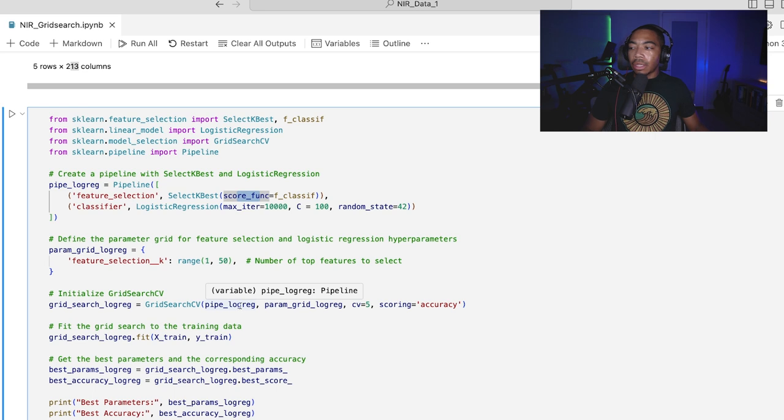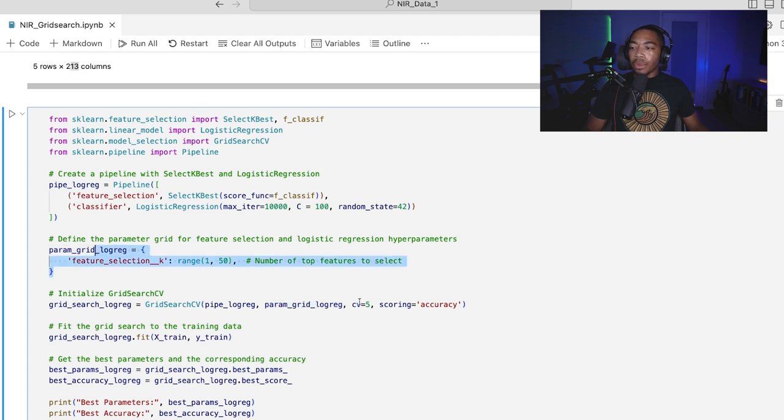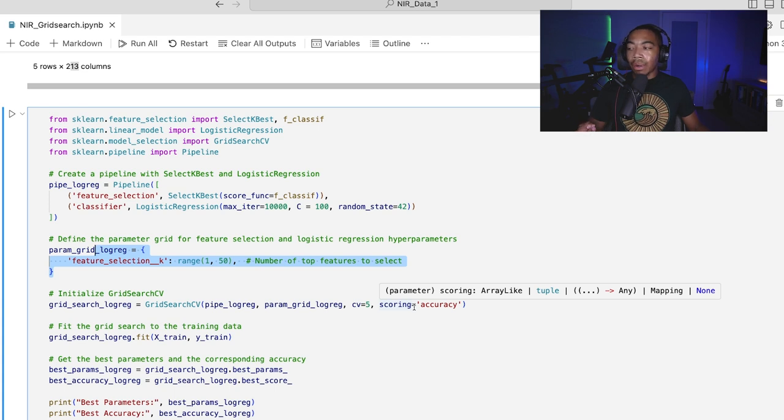And so we have our pipe log reg, which is this pipeline here. We have our parameter grid, which is this dictionary there. We're going to do five-fold cross-validation, and we're going to score the grid based on model accuracy.